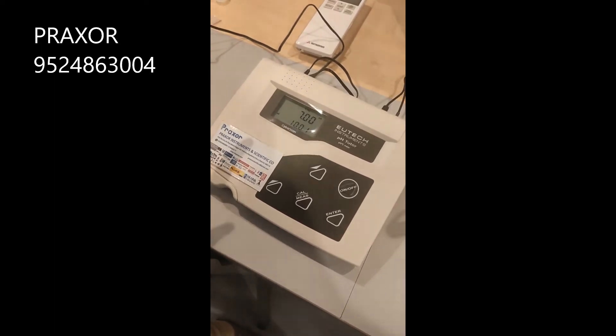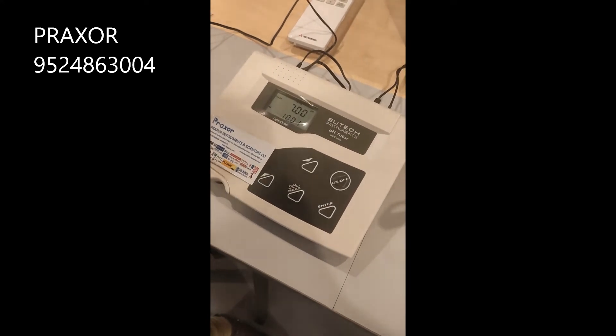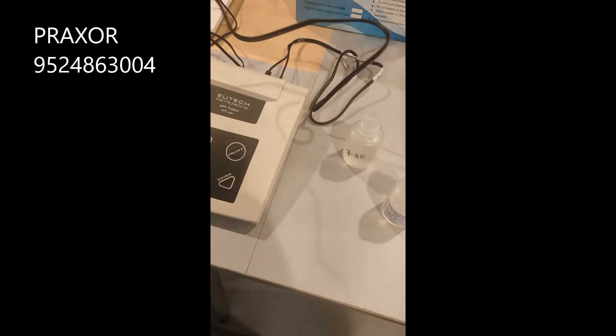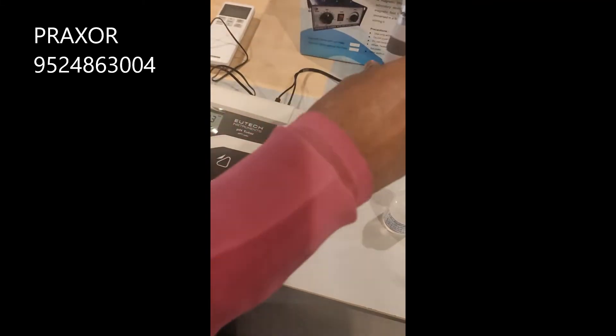Now the pH 7 calibration is done. The lower display will ask for the pH 4 or 10 buffer. Take the electrode, clean it with tissue paper, and rinse off the remaining water.